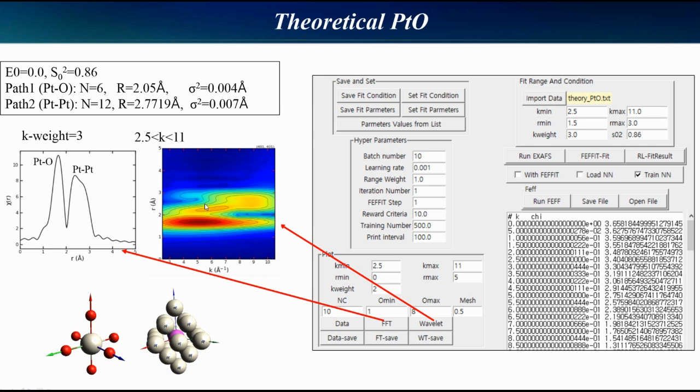We have detailed knowledge of the local structure of the mimic data because I made it once. We know the exact local structure information.